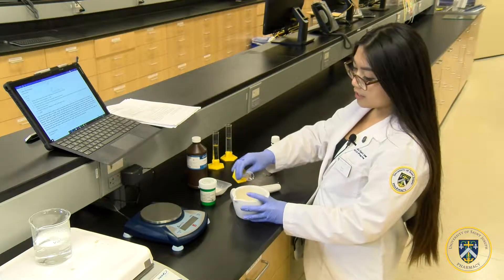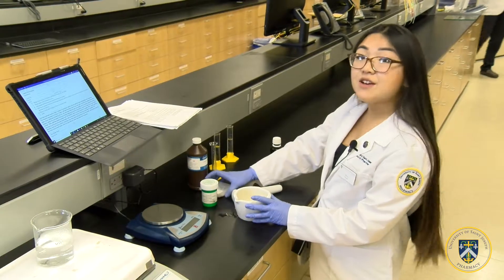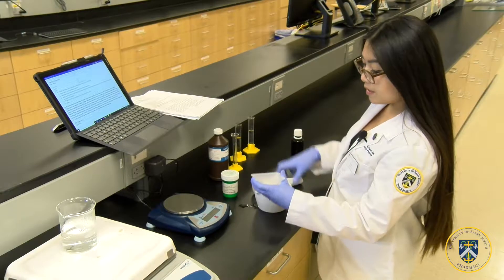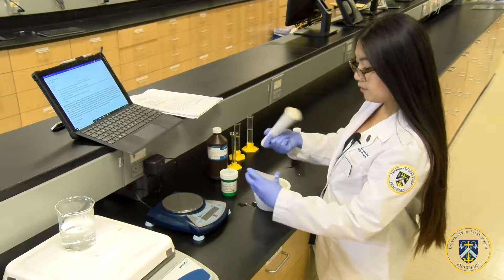First, I'm going to add the water into the mortar, and now I'm going to add the acacia powder into the mortar and triturate it until it is fully dissolved.